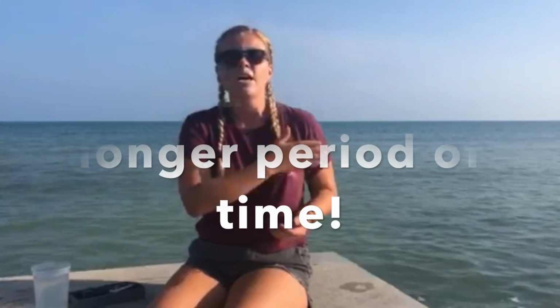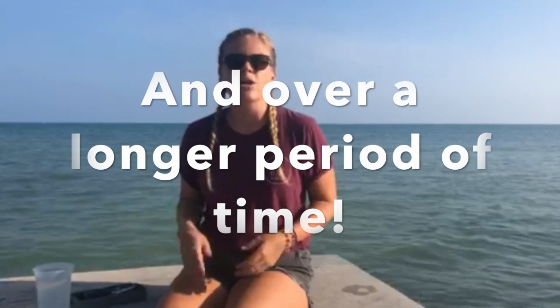Like I told you earlier today, I went back out to the exact same place I was 2 weeks ago, and we're going to test the water quality all over again. Like I also said today, if you are truly trying to test change in water quality, one of the things you have to do in the scientific method is repeat yourself over and over again. So if this was a real study, we would probably want to do this anywhere from 50 to 100 times to actually see real change. But just for the purpose of this lesson, we're just going to test it twice to see what changes we have.